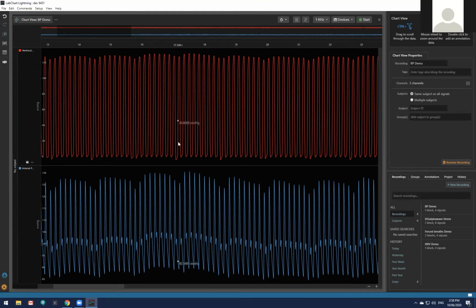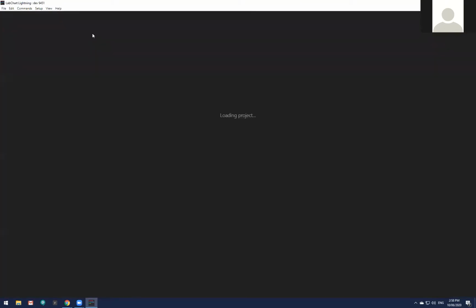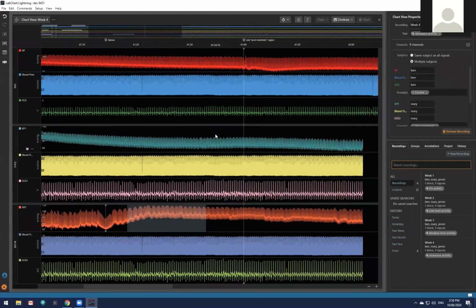Now let's just quickly go over the overlay of what we see here. What I have been doing, I'm just going to go over one of my other projects. It's a new drug trial, and I'm just going to briefly go over what we see. This is the first webinar of, I think, 4 I'm going to do. And this one, I'm just going through the overview of how you can start it up if you're new to it. The next webinar is going to be more to do with recording data.